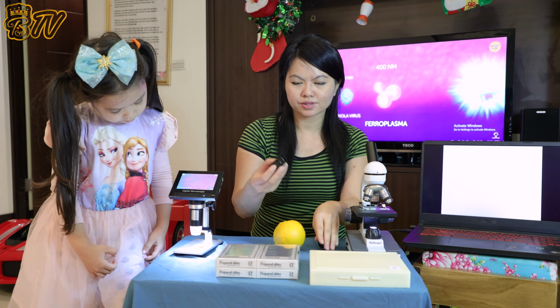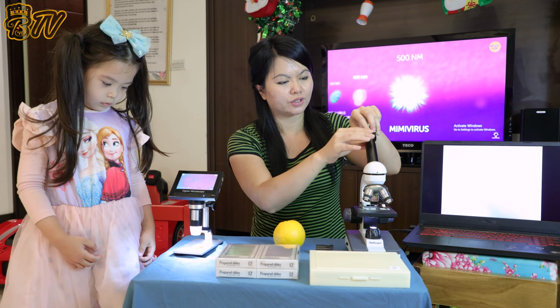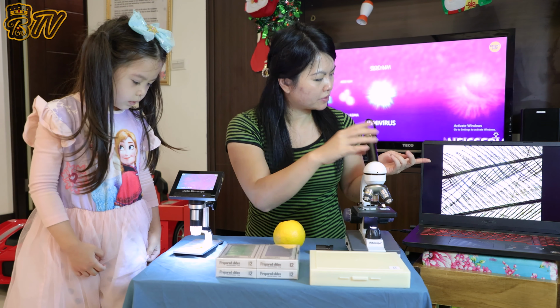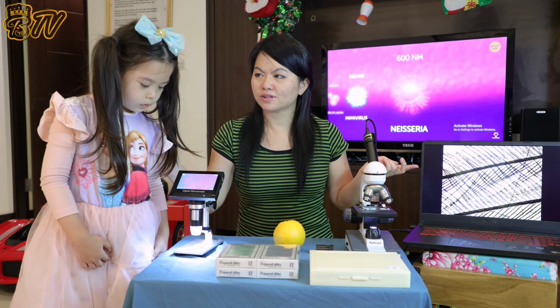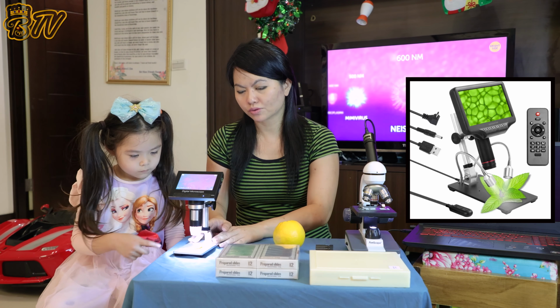And another way to do this, let me put the cap right back, is you can hook it up to your laptop. And you can see it straight from the laptop. Annabelle, see the pretty feathers? Okay. The next one is called the digital microscope.